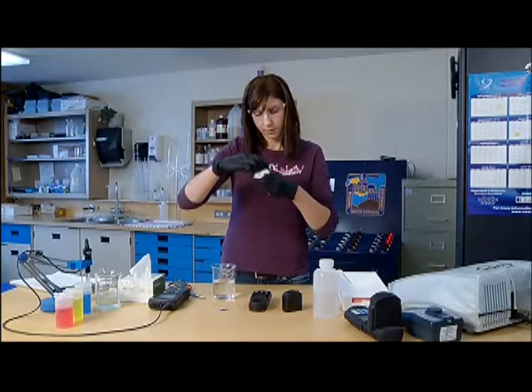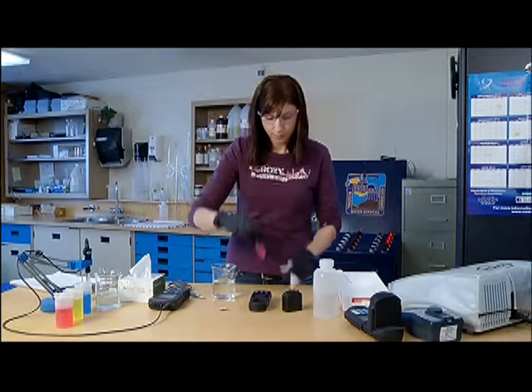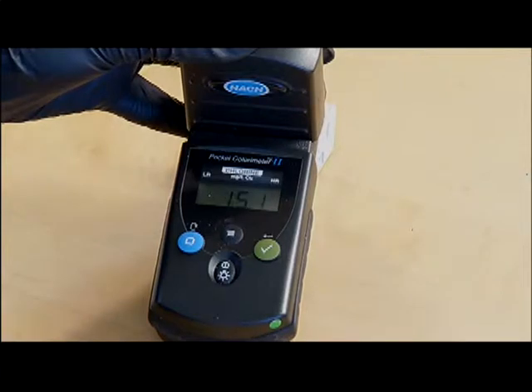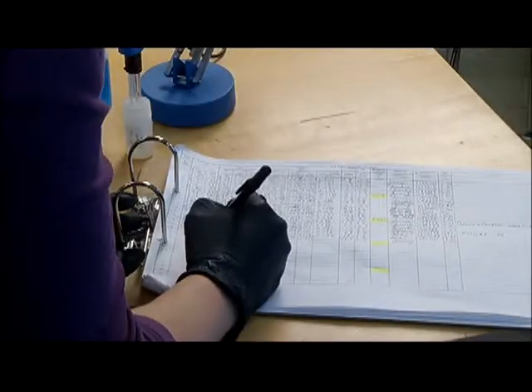Stir the vial to ensure the reagent is mixed and dissolved. Ensure the outside of the vial is free of sample residue and scratches. Replace the vial in the instrument with the proper alignment. Read the sample and record the results in the appropriate log document.